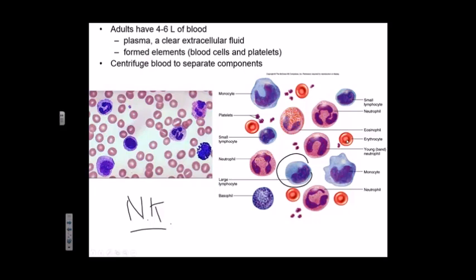If it clears out a lot, and some of these are not, that's an indication of anemia. A lot of us are anemic and we don't even know it. That's just an indication, it doesn't necessarily mean the person is anemic. It could also mean that when the person made the slide, they let it dry a little bit before they put on a cover slip, or the drying process of the slide caused that. So that's a possibility too.